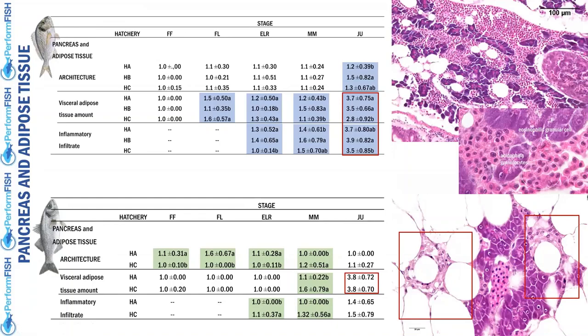With regard to this organic district, pancreas and adipose tissue, the alterations in European seabass, with some differences between hatcheries, are almost absent. Noteworthy is a similar and abundant presence of adipose tissue in the juveniles between the two hatcheries. Also, this aspect may be related to a zootechnical forcing. Similarly, also in gilthead seabream, you can see the same situation in juveniles, but with some statistical differences between hatcheries.